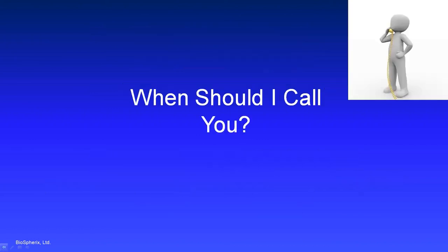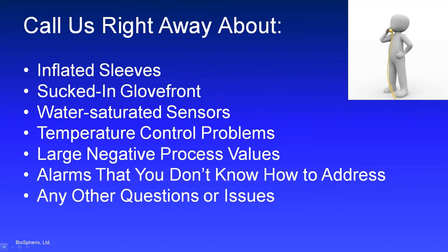When should I call you? This is a great question for new parents, whether they've got a new baby or whether they've got a new Xvivo system. You should call us right away about something that indicates there's a pressure problem in the Xvivo system. Something like if you came in the morning and you found the gloves all inflated and standing out, and that's not normal unless you're actively doing a leak test.